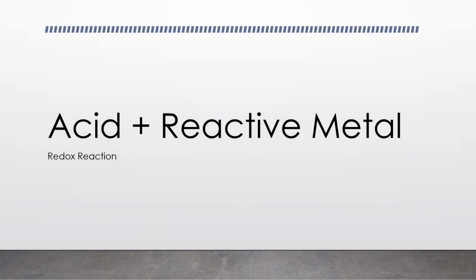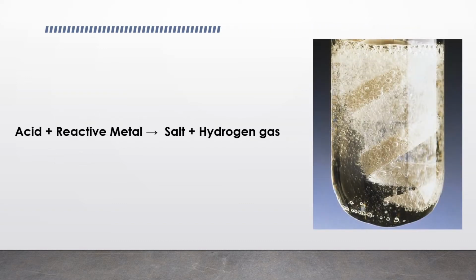In this video, we're going to be looking at acid plus metal reactions, and this is actually not an acid-base reaction, it's a redox reaction. Acid plus a reactive metal will give salt plus hydrogen gas. So in this particular case, the bubbles here are of hydrogen gas.